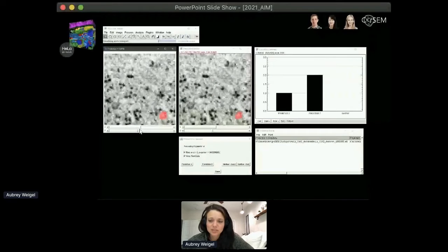Using the setups optimized via this manual validation, we can then generate predictions on the entire data set, threshold them, and thereby produce the segmentations.